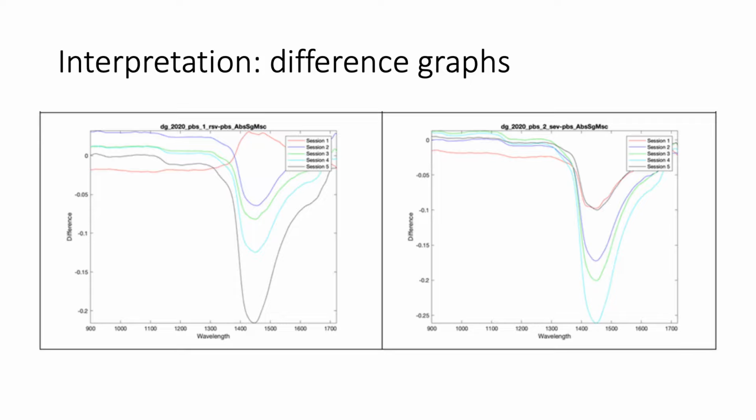Focusing on spectroscopic methods, we know some instruments have been reported as effective tools for the detection of some viruses, including influenza, RSV, HIV, hepatitis, and SARS-CoV-2.